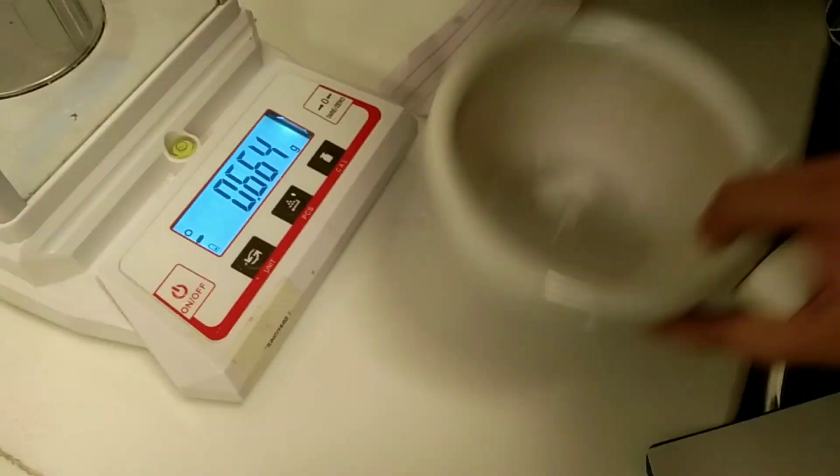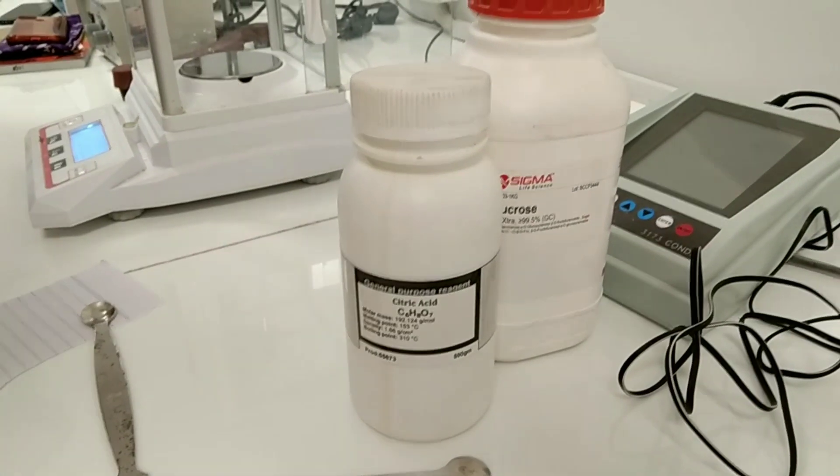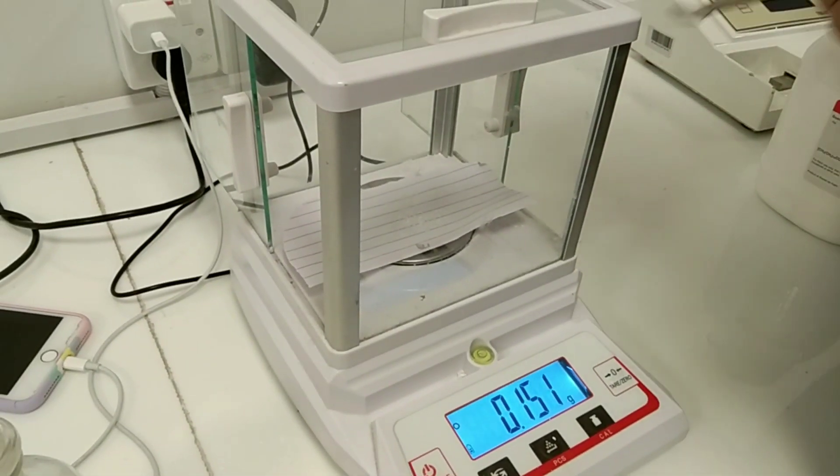After keeping this into the mortar, the next step is to take citric acid, 0.1 gram, as a flavoring agent.